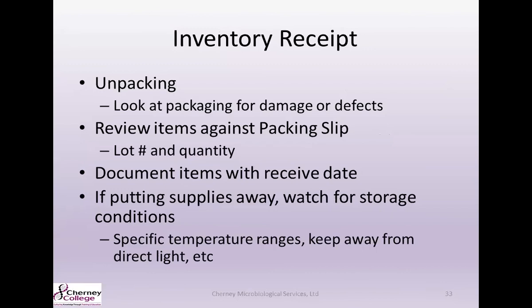Quality control when it comes to supplies, you want to make sure that you look for any damage upon receiving items. Look for any damage, defects, make sure that you review the packing slip for lot numbers and quantity. Make sure that you document your receive date and store it appropriately. Pay attention to if the inventory requires a specific temperature range to be stored at, if it needs to be kept out of direct light or anything like that.